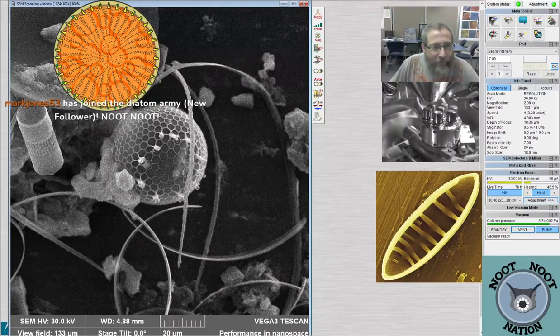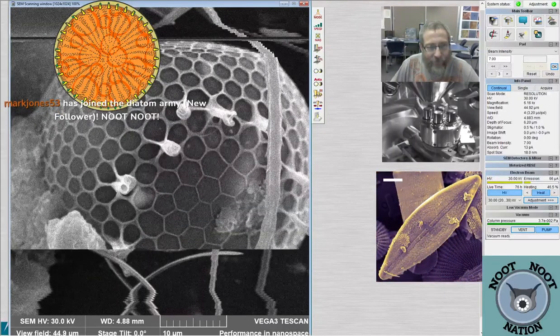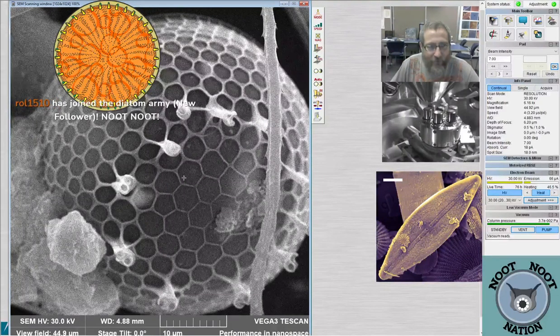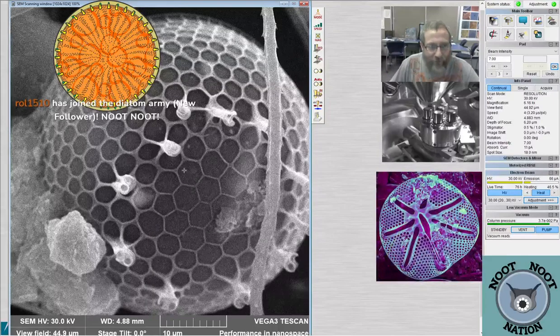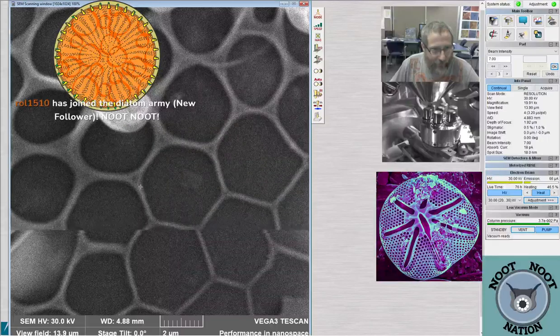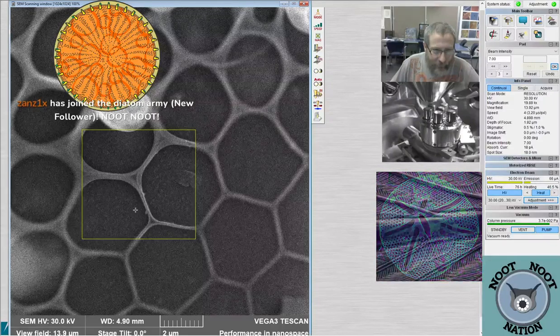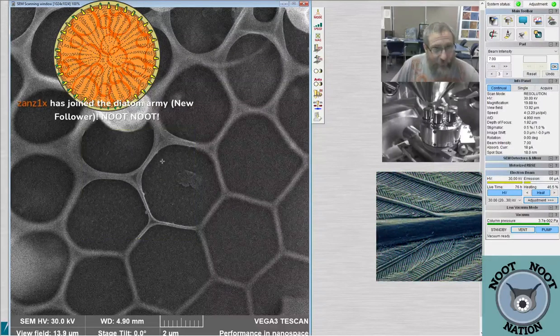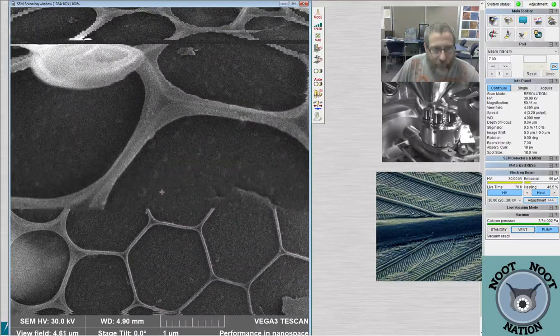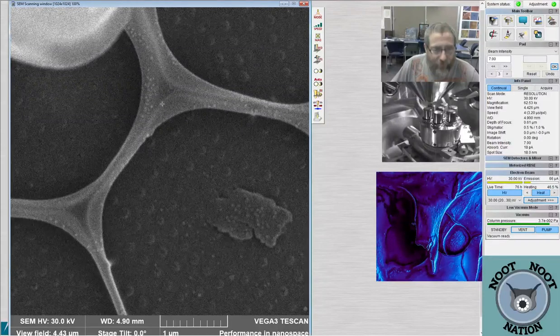This is a Stephanopyxis. Just one of the cells, and its crazy little spines on its face. And then these weird little hexagon structures that it has over top of everything. So that one's Turris. This one is Turris. The other one has only, I think, four or six of the connecting, non-knuckling spines. I don't know what the right term is for the ones that don't knuckle together.